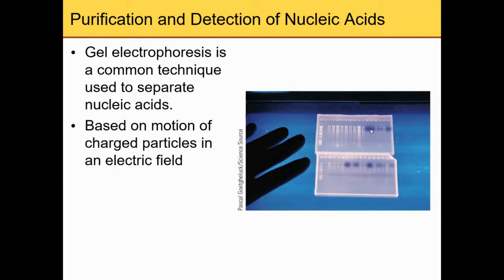And here you can see the dye. These are so-called tracking dye, because the gel, you can see this is UV light, right? So you incubate, or you add the ethidium bromide to the DNA, and then in the presence of UV light, you'll be able to visualize the DNA. If you don't use the ethidium bromide or the UV light, you don't see anything, all right? So basically, this tracking dye can help you to estimate the location of your DNA fragment size.